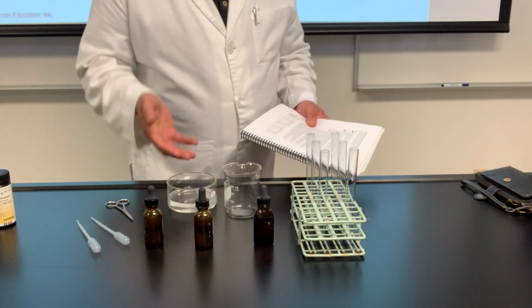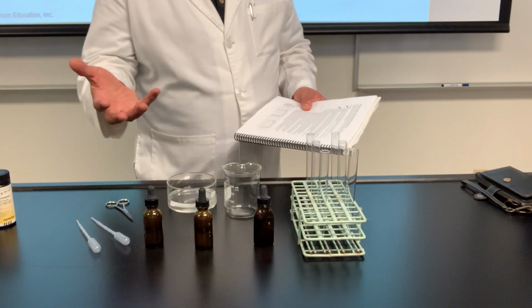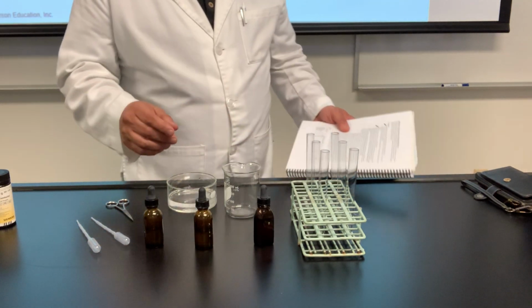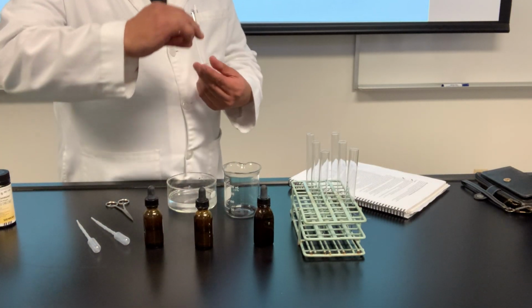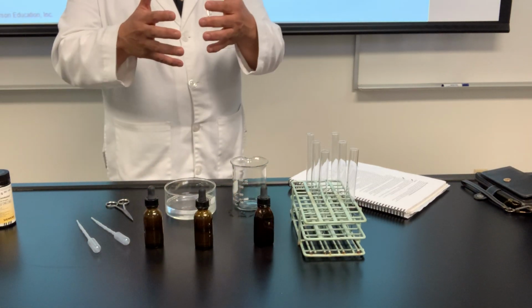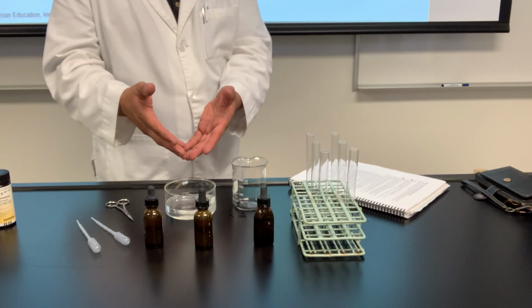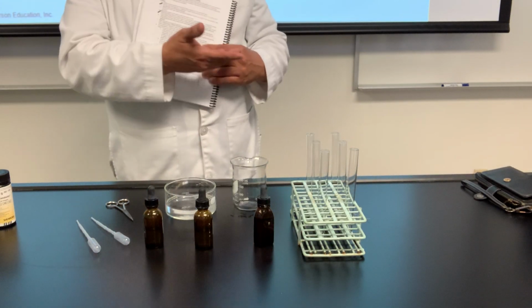Obviously, these are solutions, so you also have water. Solution A also has water, and solution B also has water. We set it up where we added solution A to the dialysis tubing, and we sealed the two ends, and we placed it in solution B, and we let it go. And as long as you guys have been doing the microscopes, there's been diffusing. Things are going to move from high concentration to low concentration.